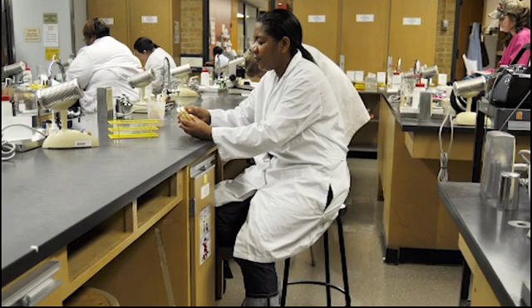Scrub pants, in addition to the lab coat, is an acceptable cover for the legs and can be worn over other garments and stored in the student tray between labs. The lab coat must be stored in your student tray and is not allowed to be taken out of the lab unless it is disinfected or sterilized first. You must also tie any long hair back with a ponytail holder or other device.